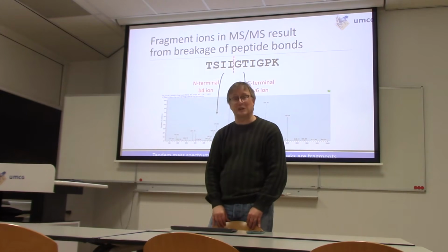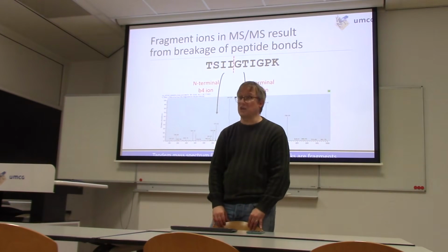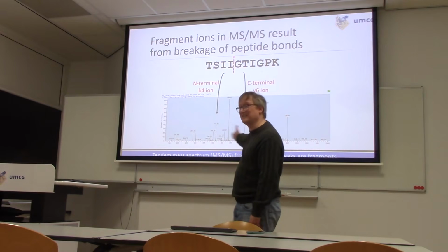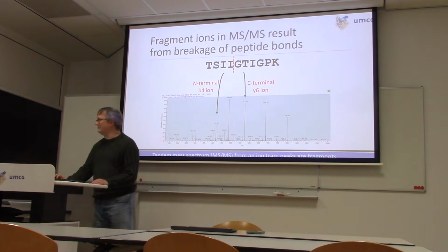It is a skill you can learn, and you can get pretty good at inferring sequence from MSMS scans. But it is a challenge to do so, and not all of the spectra are beautiful. This is an example of a good spectrum. Bad ones are much, much harder to read.